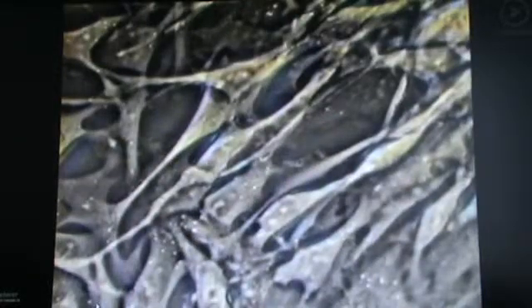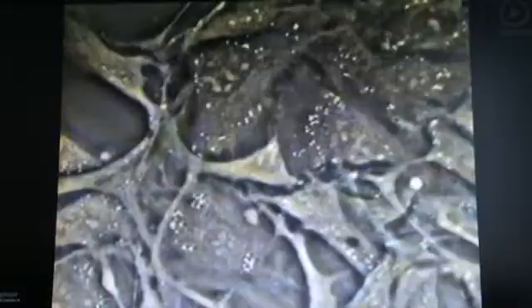This tissue structure, consisting of multiple overlapping layers, is shown with the conventional phase contrast technique at maximum magnification. You can only see a few contrast differences without any details. The Ergonome 500 microscope shows, using a substantially higher magnification and resolution, more details of the interlacing tissue layers, with both more image depth and depth of field.